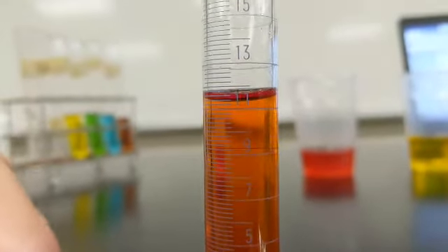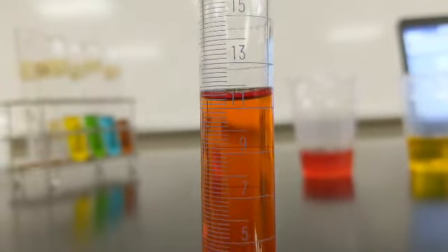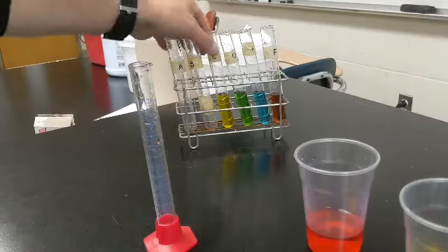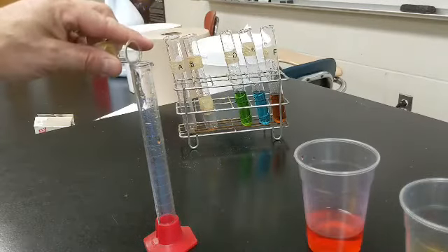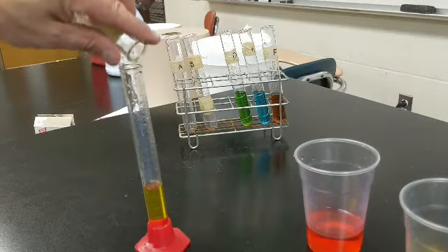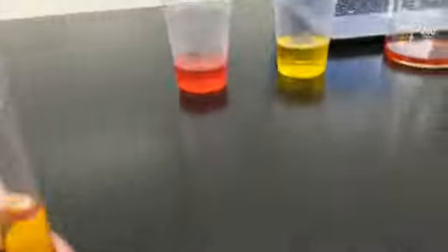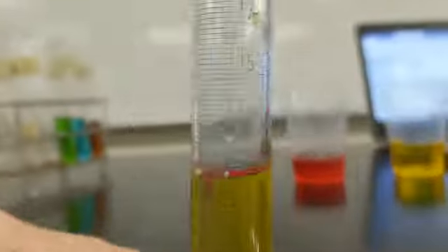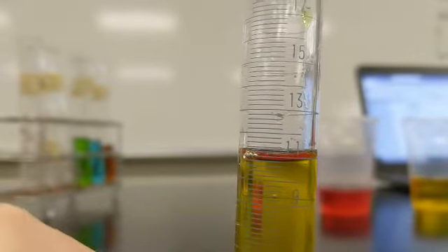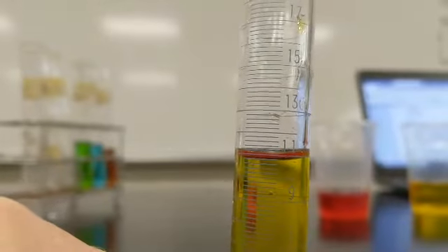So I would call that 11.4. 11.4 milliliters. Okay, this is C. It looks like C is the same as A, about 10.8 milliliters.